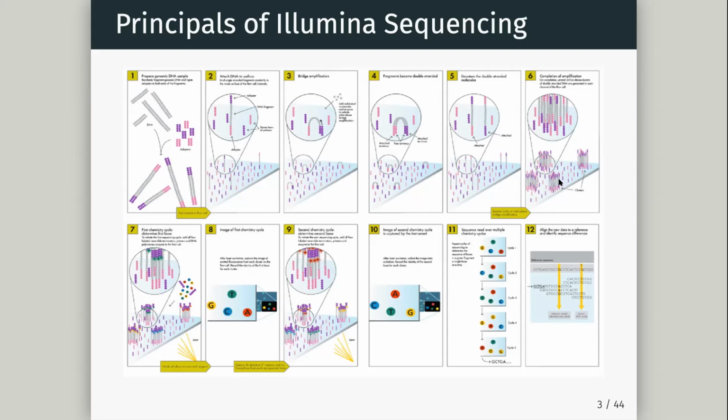So in one spot, we may have our DNA we want to sequence, and we have an A, a G, third cycle is a C, fourth cycle is a C, and over 100 cycles, we'll get a 100 base pair sequence for every single cluster. Okay. At the end result, we have usually a program. I think in Illumina, it's BCL2FastQ.